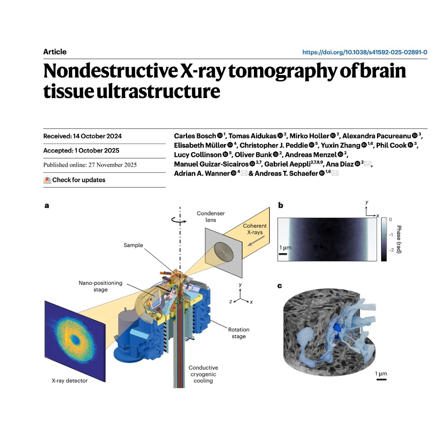Welcome to the Deep Dive. Today we're taking you inside what is probably the most critical and complex frontier in biology, mapping the actual physical structure of the brain. We're talking about something called connectomics. The goal is to understand the complete wiring diagram of neural tissue, right down to the subcellular level.